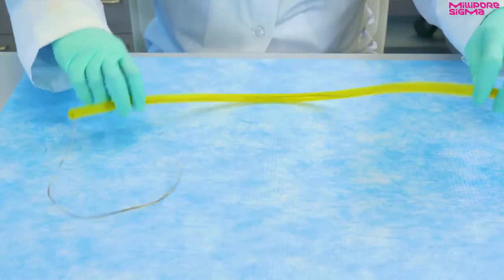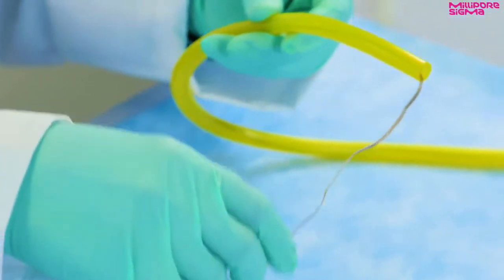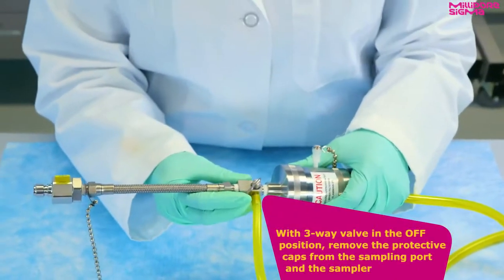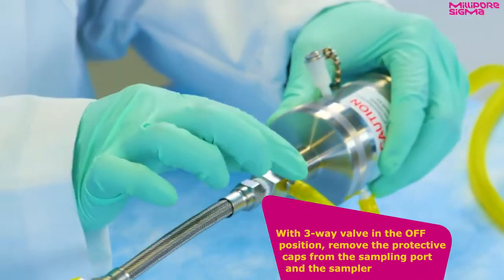This is the other end of the hose which should be placed into a collection container. With the three-way valve in the off position, remove the protective caps from the sampling port and the sampler.